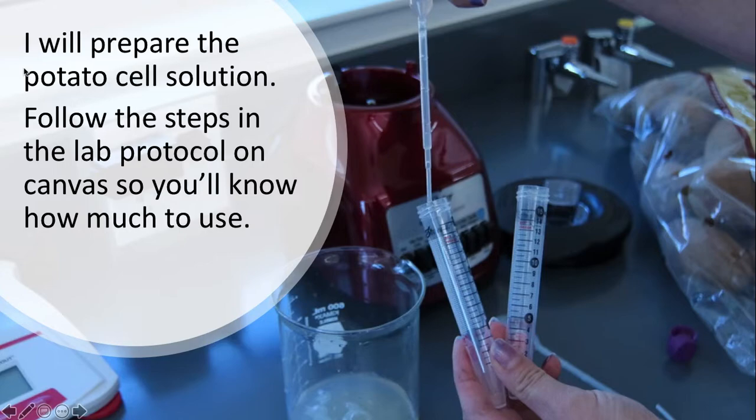This potato solution essentially helps us see the browning of the potato. As you all have probably seen, whenever you cut up fruits and veggies, a lot of them will turn brown after sitting out for a while. So you cut up an apple.